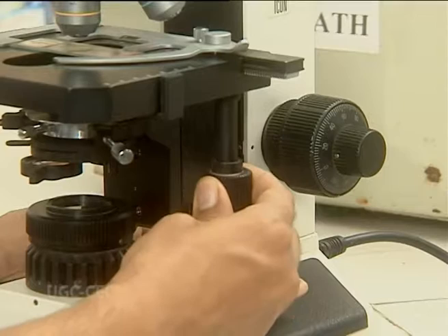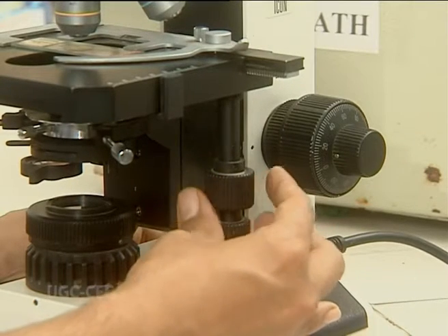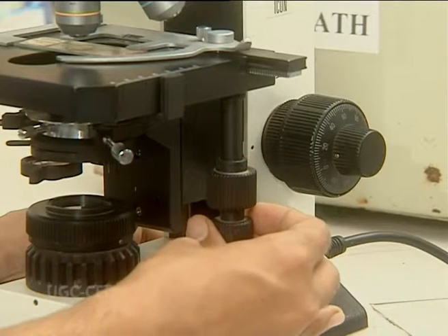Stage rack. The slide holder is used to secure your slide in place so you will not inadvertently change its position. The paired knobs below the stage on the right hand side move the slide holder either forward and backward or left and right. These allow you to precisely control the position of the sample on the stage. The scales on the slide holder can be used to determine the position of an object on the slide. Thus, we can find an object, note its location, move to a new position, and then later return to the mapped object.